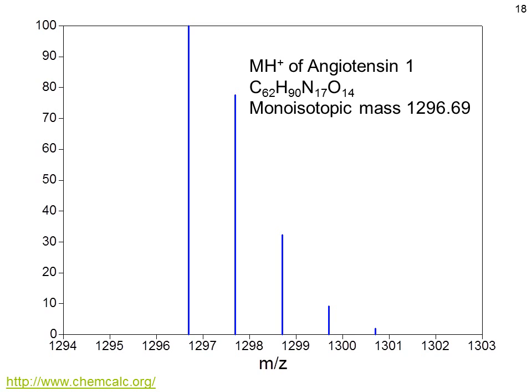The intensity of these peaks simply reflects the statistical probability that there is 1 carbon-13, 2 carbon-13s, 3 or 4 in the same molecule. This gives the so-called isotopic envelope.